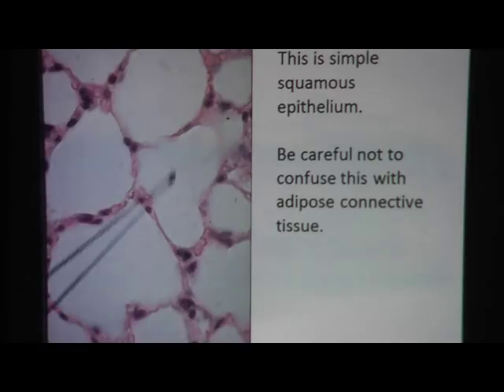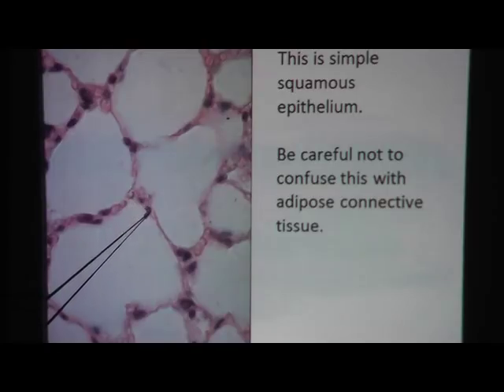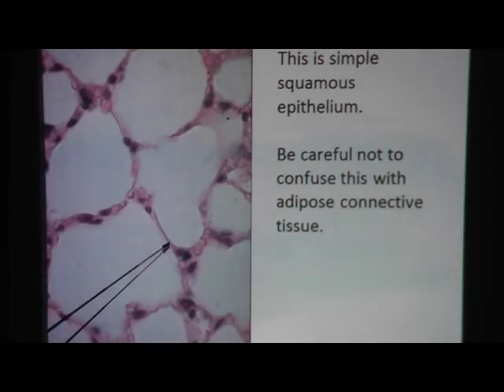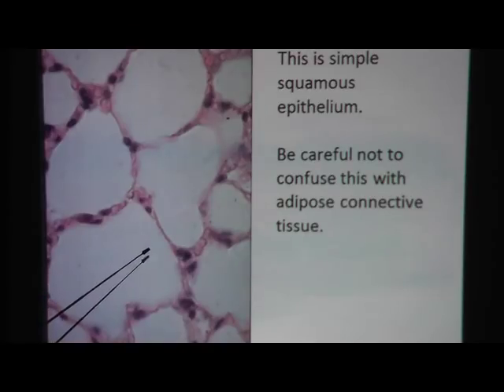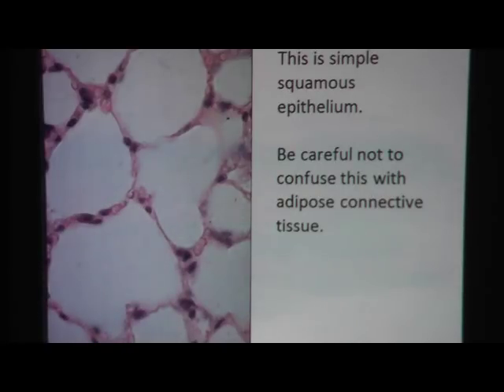That low nucleus count will help you distinguish adipose from simple squamous epithelium. This is simple squamous epithelium — this is not adipose tissue. What gives it away? The nucleus. Here there are way too many nuclei, because each of these is actually one cell with its own nucleus. In adipose, the whole large round structure is one cell. In simple squamous, that large open space is an air sac in the lungs. At first glance they might look very similar, but pay attention to the nucleus and that will help you get the right answer.